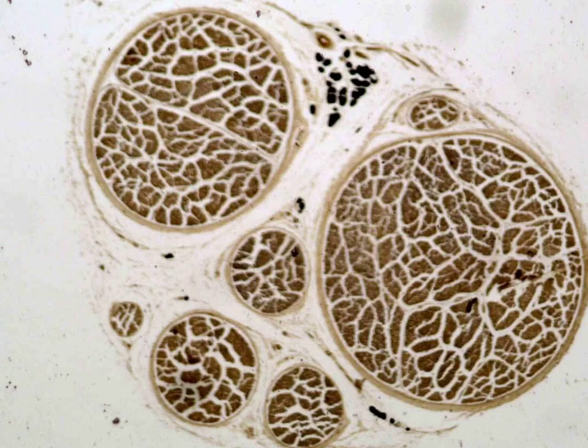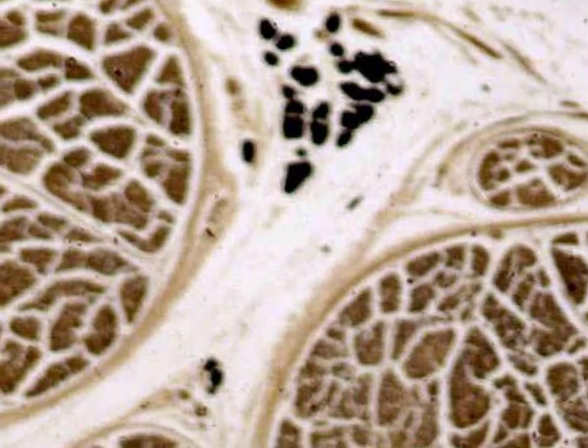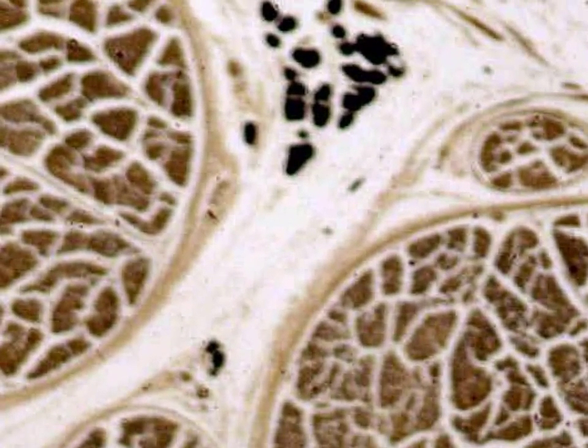Here you have the bundles of the nerve fibers, and they are not so evident in the picture, but I can see that they are all stained with this brown-black color. Also we have here a collection of cells which are large and filled with a black stain. Actually these are fat cells. These are collections of fat cells. These fat cells are filled with fat that stained black with the osmic acid.